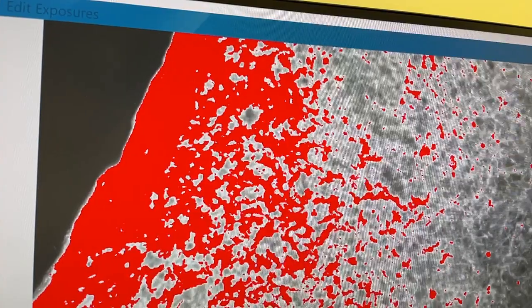Focus, focus, focus. Tell it to look for the GFP. Oh, that's GFP. Oh, God. Well, that's overexposed. Ta-da. Oh, that's not in focus, though. Great. Which slice is this? Ugh, mounting media is pulling away. Gross. Hang on, where's the DAPI?